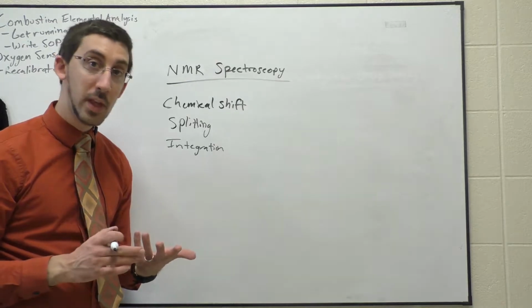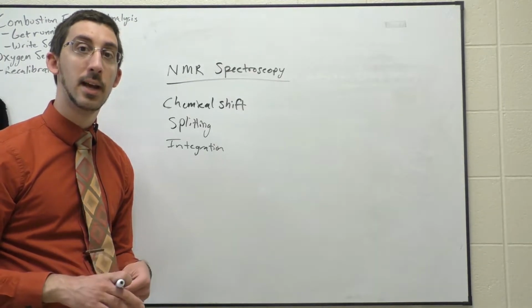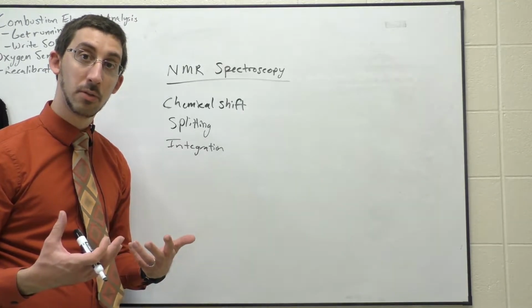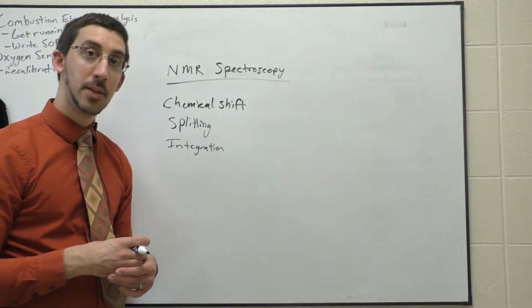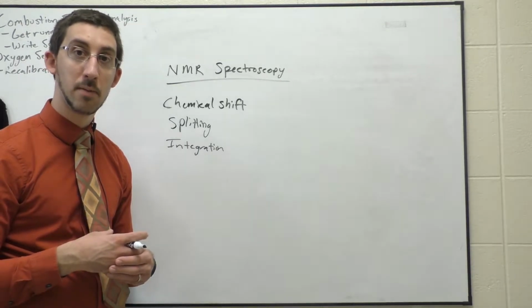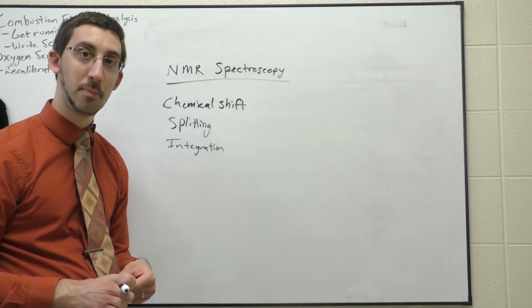So I won't go through the theory here because we should have gone through that in pre-lab reading and pre-lab videos. But these are just a quick reminder of the things that we're looking for in proton NMR. So let's go to the lab and do some NMR sample preparation.